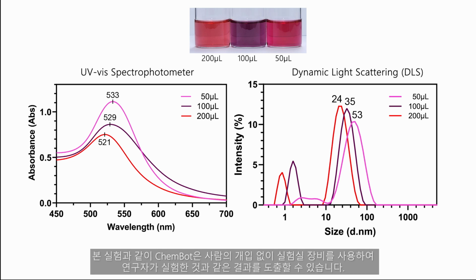As demonstrated in this experiment, ChemBot can conduct experiments using laboratory equipment without human intervention, producing results comparable to those obtained by researchers.